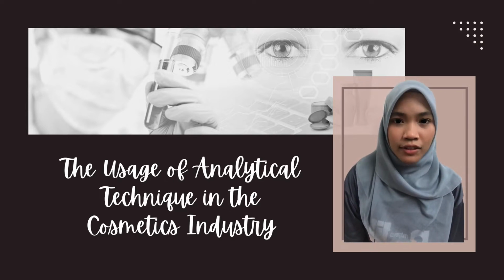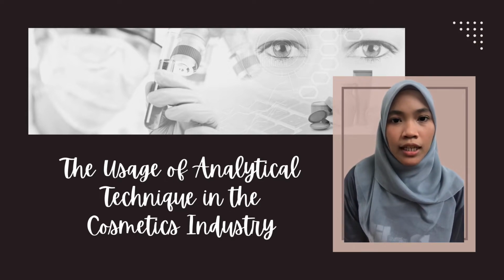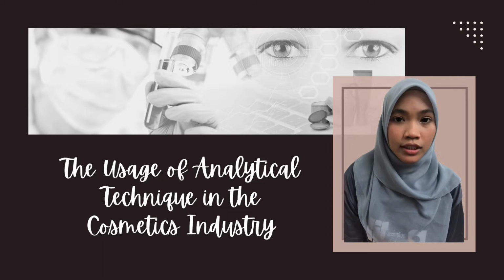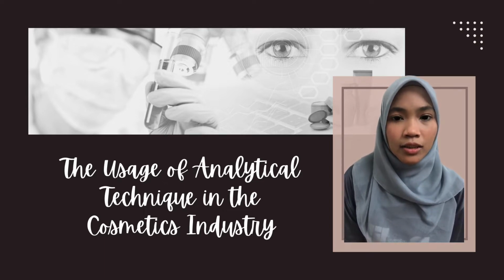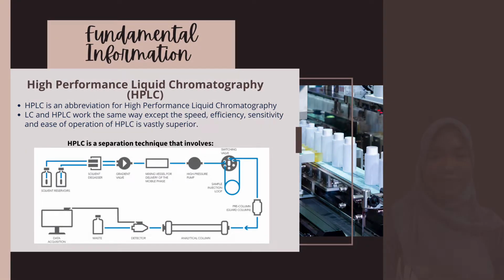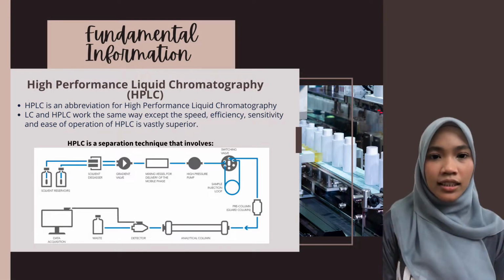AW210104. For this individual assignment video, I will be explaining the usage of an analytical technique in the industry that I have been interested in, which is the cosmetics industry. The analytical technique that is usually used in cosmetics is HPLC.